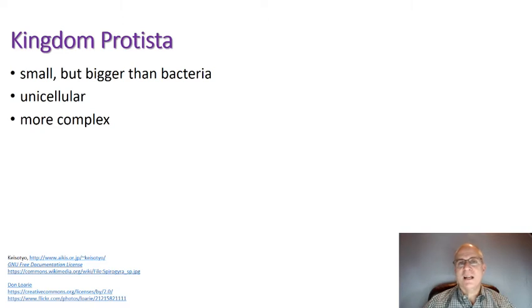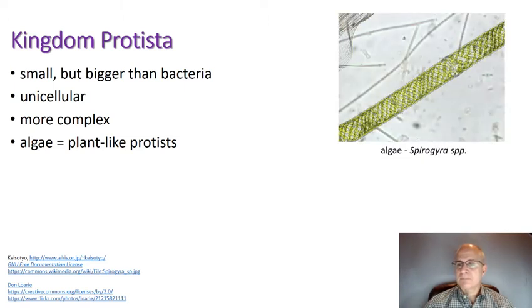And there are 2 main types of protists that we'll be talking about. You've got the algae, which are the plant-like protists that are able to do photosynthesis, like this beautiful algae right here, which is called Spirogyra. That's the genus name. And when you see SPP afterwards like this, means that we know the genus is Spirogyra. I don't know what the species is, but it's one of the species in this genus.